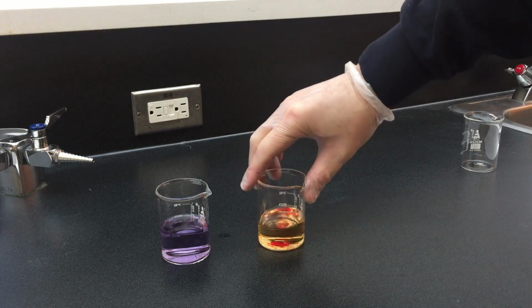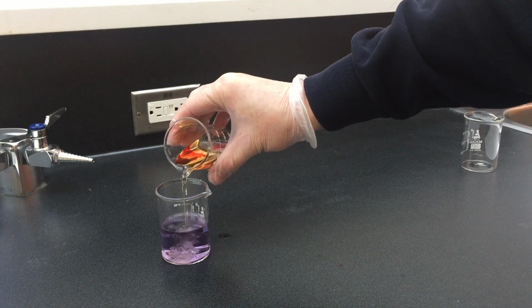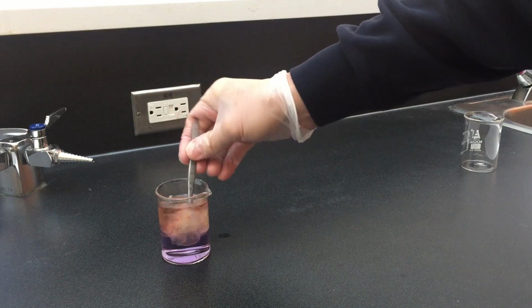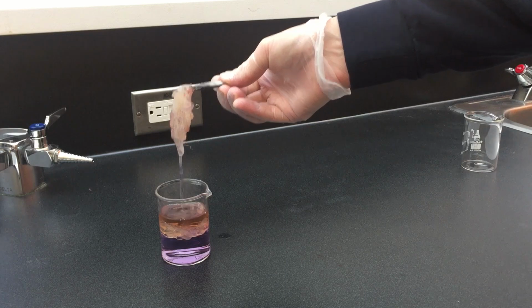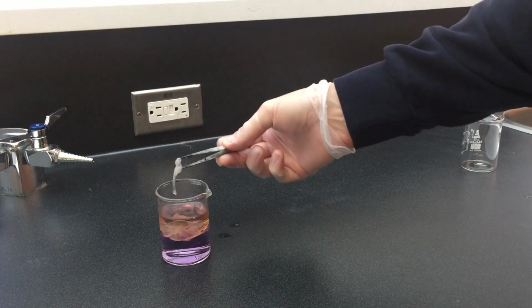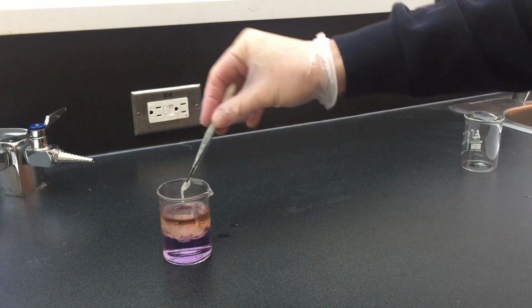When I pour the cyclohexane with the diacid into the amine, the cyclohexane layer stays on top. Where the two reagents mixed, we now have an interface, and we can pull out some of our nylon. Now, that's not how we want to do it. How we want to do it is to, right at the interface, grab some nylon and pull out a fiber.